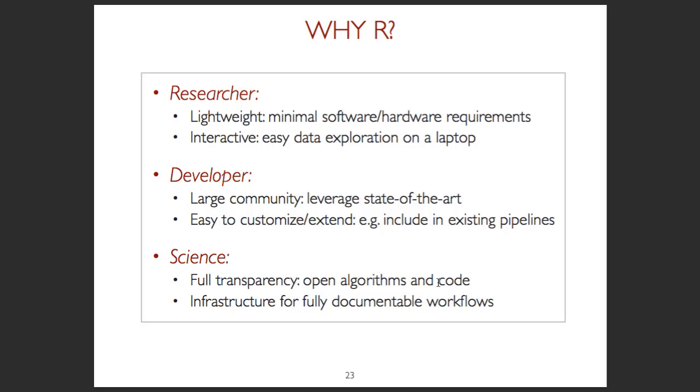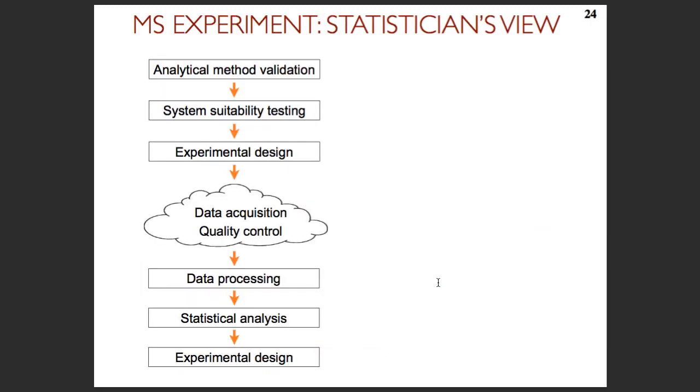So we feel that, well, again, there are many ways to do things, but this is a way which we think really covers a variety of needs. So we think that this is quite interesting. So what we will do for these 2.5 days, we'll actually use R to work through R scripts, which would allow us to use some of the MSstats functionalities to analyze the IPRG data set. This will be, at least for today, the plan. Okay, any questions so far?